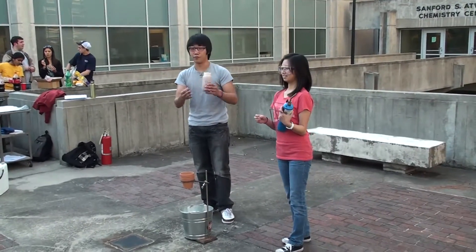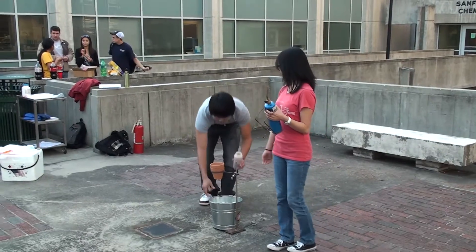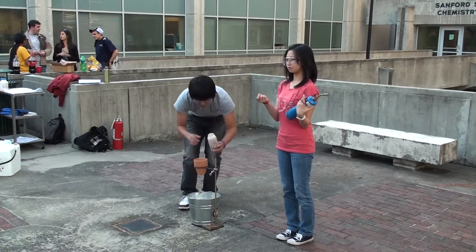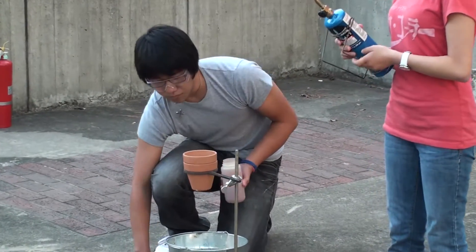It's a mixture of aluminum and iron oxide. Aluminum is a very strong reducing agent. What it does is it rips the oxygen from the iron oxide, and we get aluminum oxide and iron.